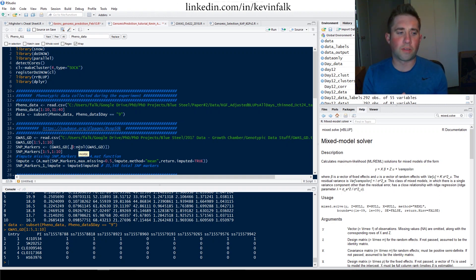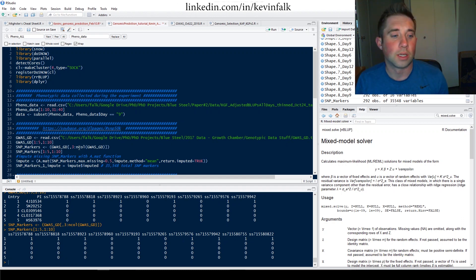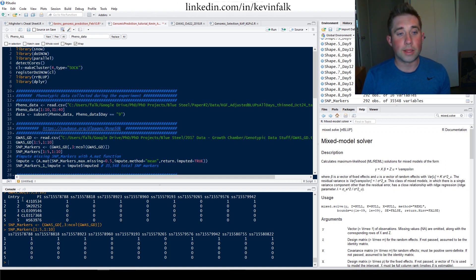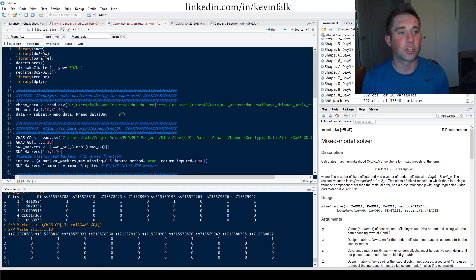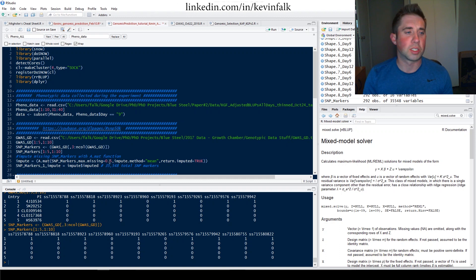The first thing I want to do is cut off the first two columns, because we're not going to need the entry or the PI number for the model — we just want the SNP data itself. Now that we've renamed that data frame as SNP markers, we've eliminated those two columns. There may be missing data, and when you download from SoyBase there is some that you need to impute. To impute this data, I use the a.mat function within rrblup, with max missing set to 0.5 and the impute method set to mean. I'm going to skip running that today since I ran it previously.